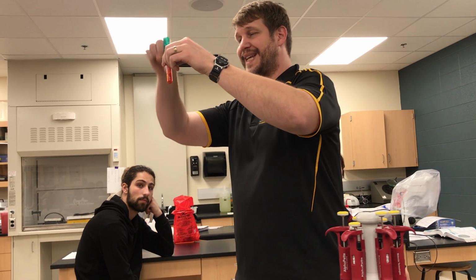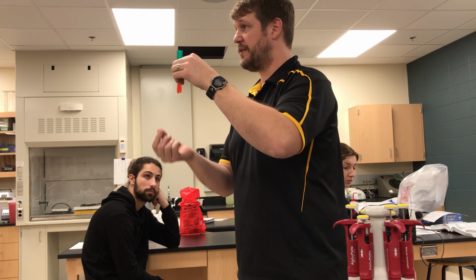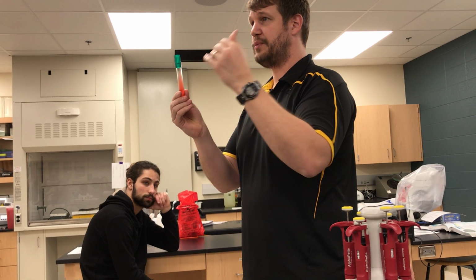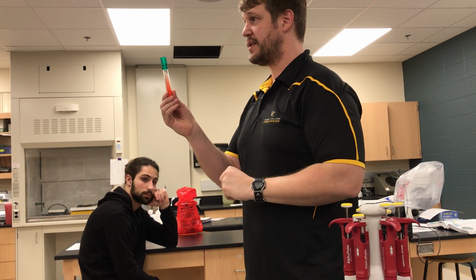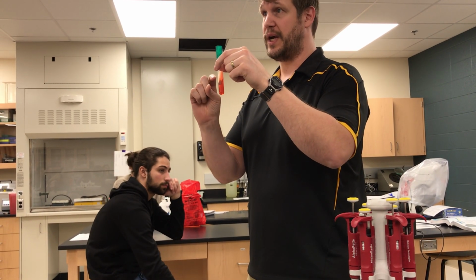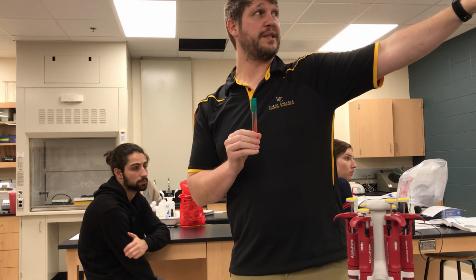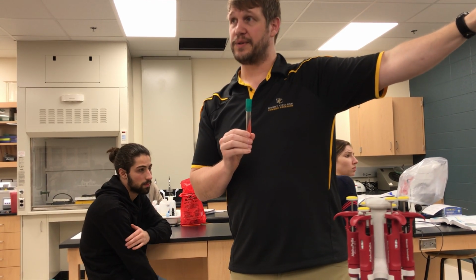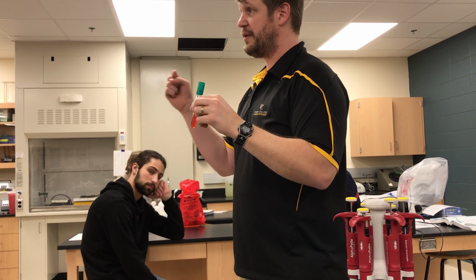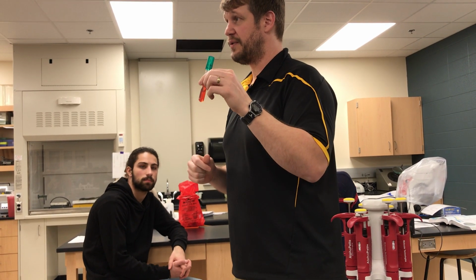And so the stab down into the bottom will create an anaerobic environment, in which case an organism would be fermenting the sugar, whereas in the slant portion, it would be carrying out aerobic metabolism of the sugar. So you can actually look at the fermentation and oxidation of both glucose and lactose in the same tube. And you're also able to identify, right, aerobic versus anaerobic growth, utilization or production of hydrogen sulfide.